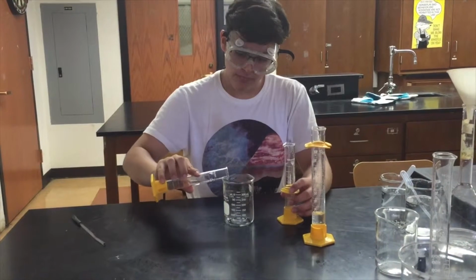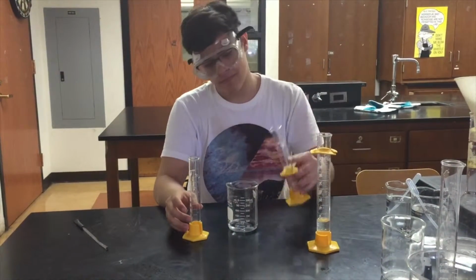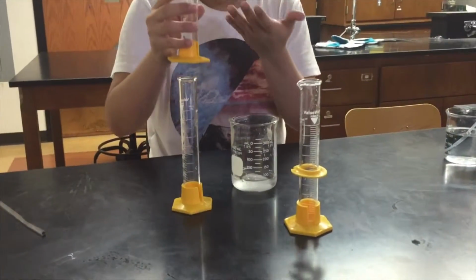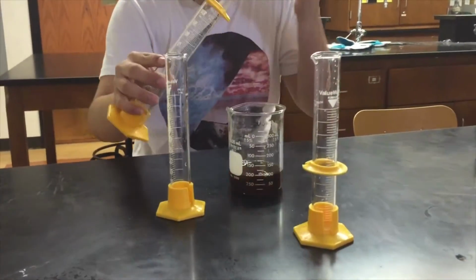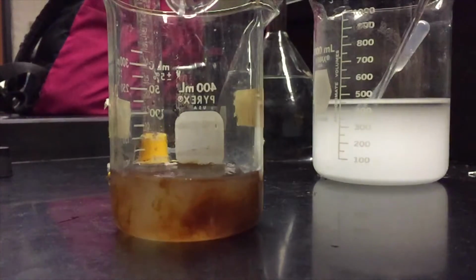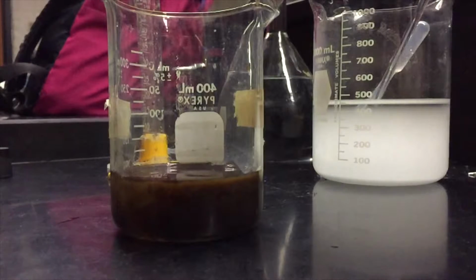Now that we have all of our solutions ready, we will begin the iodine clock experiment. We will begin by adding the sodium metabisulfite and the starch solution. By adding the potassium iodate, the solution will change colors. Although it may seem like an immediate change to the naked eye, now we can see in the slow motion that it is slowly turning to black due to the different concentrations throughout the solution.